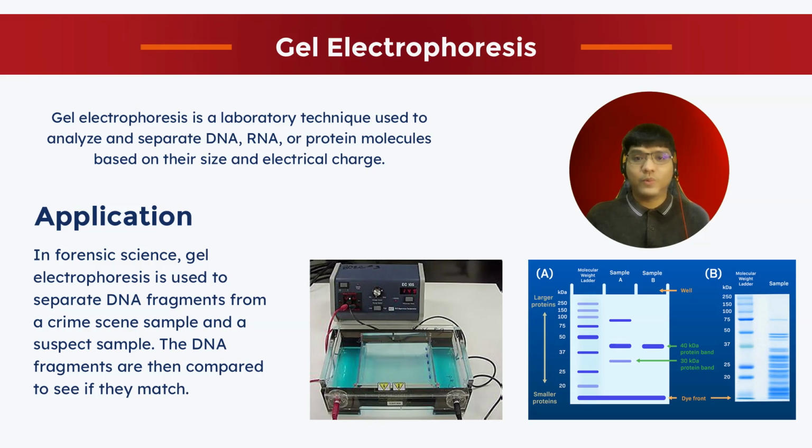Now, let's have a quick check. Why do smaller DNA fragments move farther in the gel?